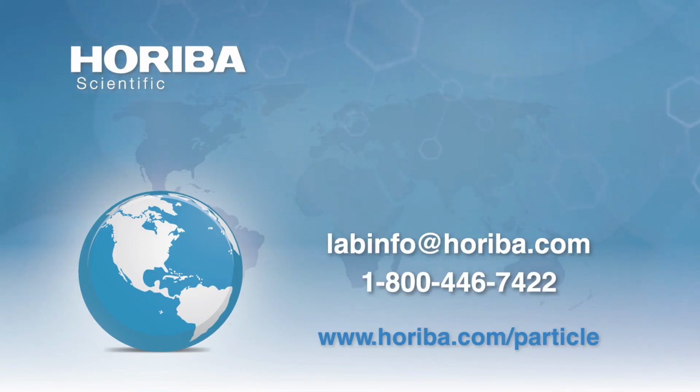Thank you. Next question. Are there resources online where you can find a collection of zeta potential versus pH for different materials? Okay, so the answer to that one is probably not. However, what you can find if you Google the name Marek Kosmulski, K-O-S-M-U-L-S-K-I, is that he has at least two books, or one book and one main review, which lists dozens and dozens of isoelectric points and gives some examples of profiles.